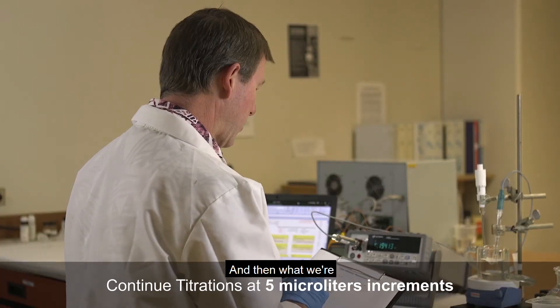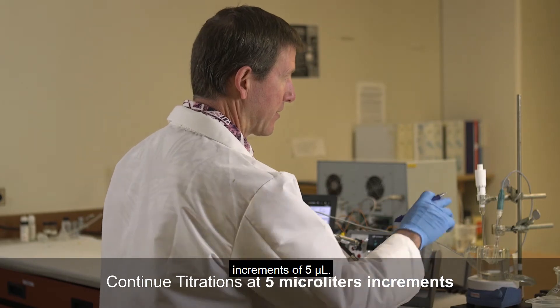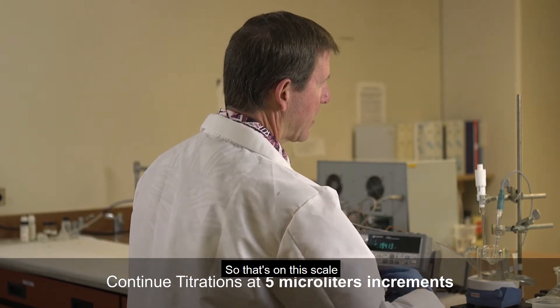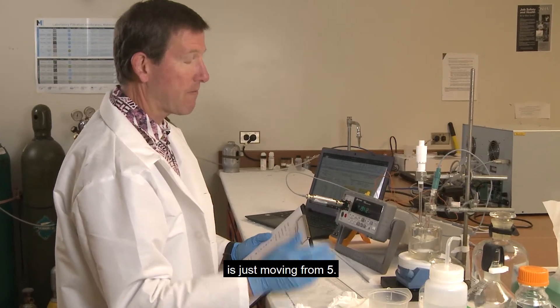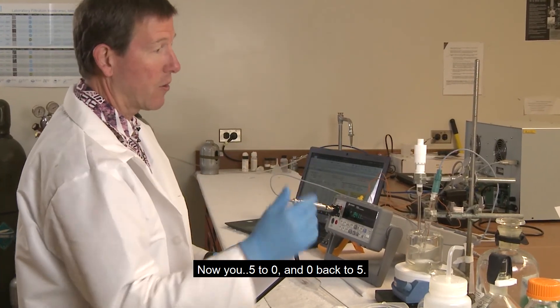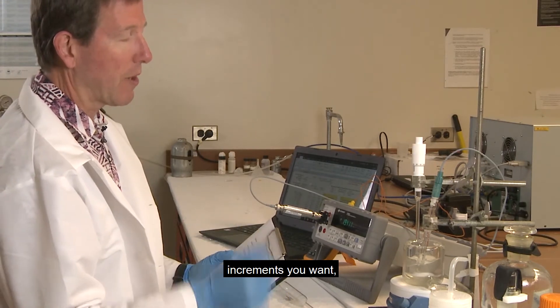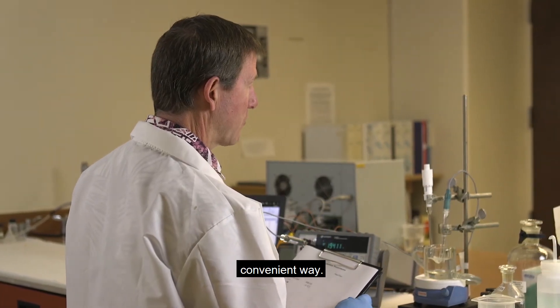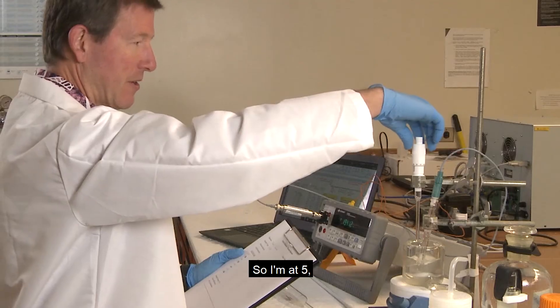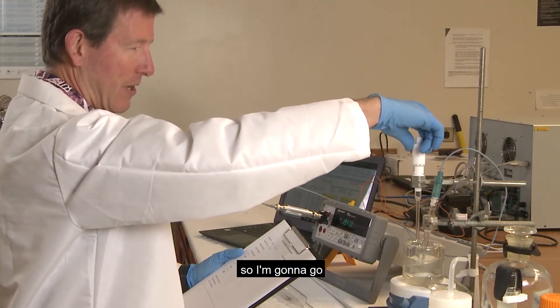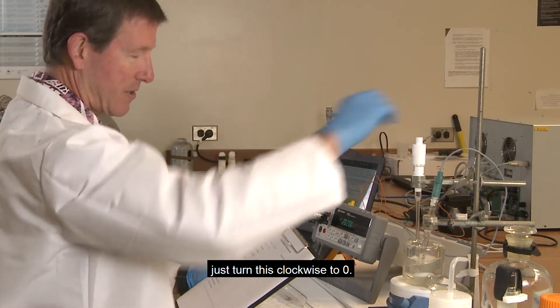And then what we're going to do is we're going to do titrations in increments of 5 microliters. So that's on this scale is just moving from 5, now 5 to 0, and 0 back to 5. You can use whatever increments you want, but I find that a nice, convenient way so I don't have to think too carefully about where I am and what I'm doing. So I'm at 5, so I'm going to go just turn this clockwise to 0.